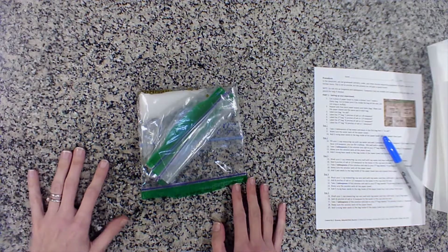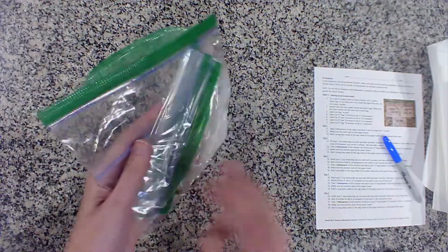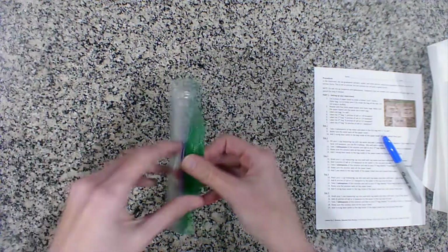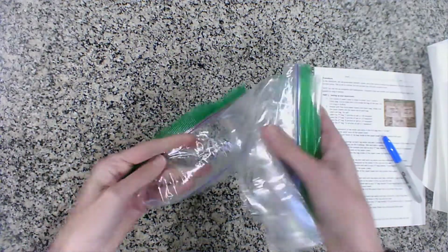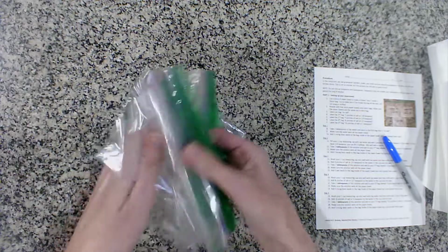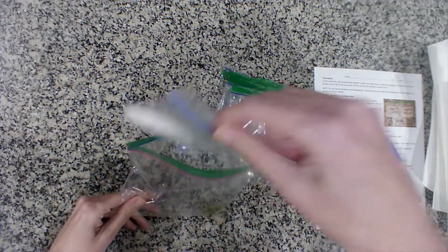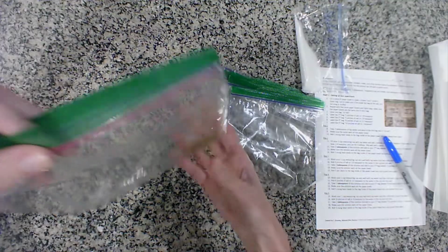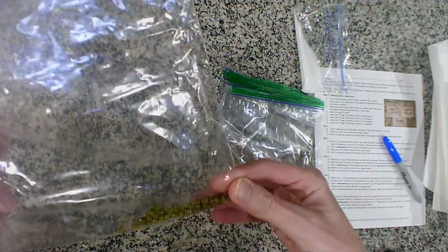Alright guys, I'm going to show you how to set up for the LD50 toxicity lab. You should have picked up a packet that looks just like this from the main office. Inside of it, so it's literally just a sandwich baggie, you should have 4 additional sandwich baggies. 1, 2, 3, 4. A small baggie of salt, NaCl. And then inside the main baggie, you got a handful of mung beans.